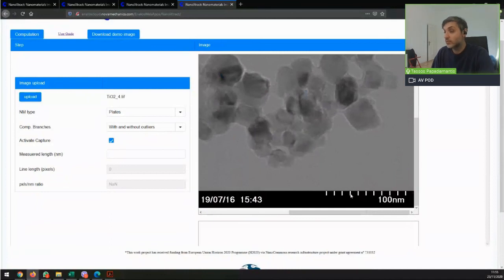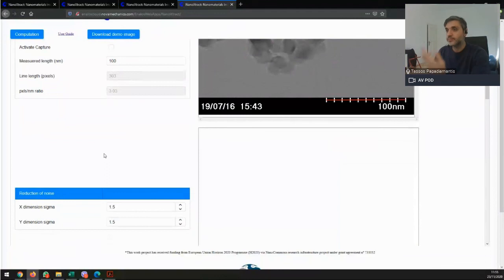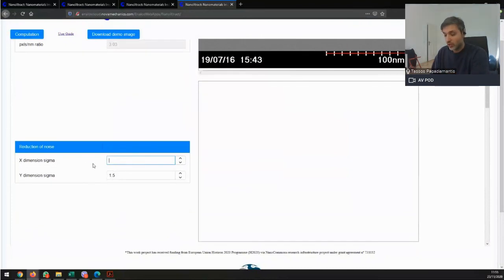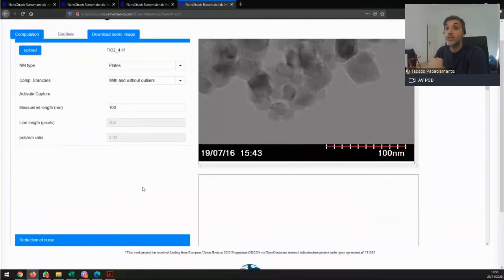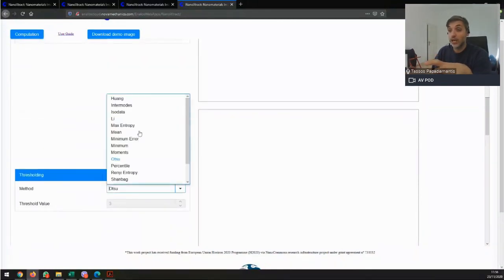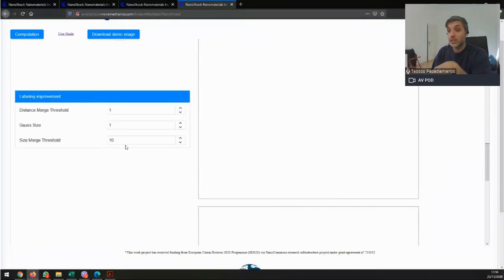I could not see it before, but now I found that it actually has the magnifying lens. And they magnified. So if you want to make sure that something doesn't go wrong with the scale, I would suggest that you use Chrome to run the tool, so that the image will not automatically zoom. Or, what you can also do is use Firefox to run it so that you can see the entire image and identify the correct settings to analyze your image, and then transfer to Chrome to validate your results, to see if with the exact same settings you get a good result out.